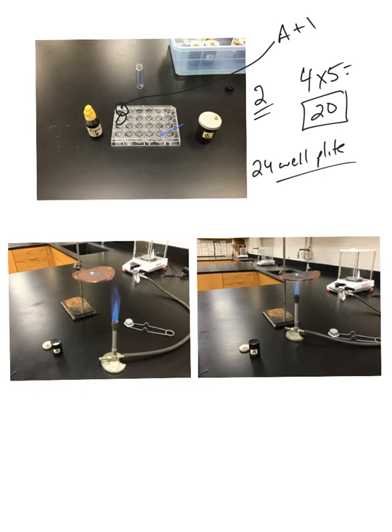Now here again, more is not better. I would use 1 or 2 scoops max, and if you add 1 drop of liquid and it turns a stark color, then that's all you need to add. I would not add more than a maximum of 5 drops of liquid. You just won't need it. So 1 or 2 scoops of each of the powders mixed with anywhere from 1 drop to as many as 5 drops. And you're looking mainly for color changes or reactivity between the powder and the liquid.